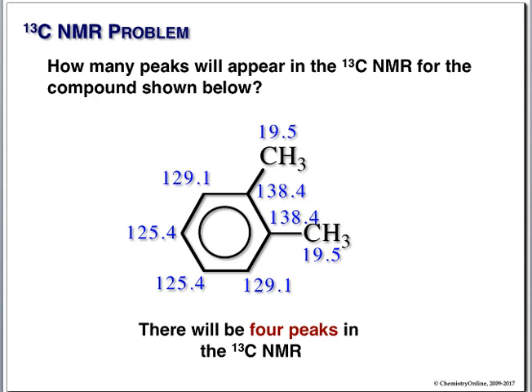Carbon-13, which is what we're looking at here, is indeed spin of 1/2 NMR active, but so is the hydrogen. So when we take a compound and we stick it in the magnetic field, not only the carbon nuclei are going to be oriented, but the hydrogens are too.